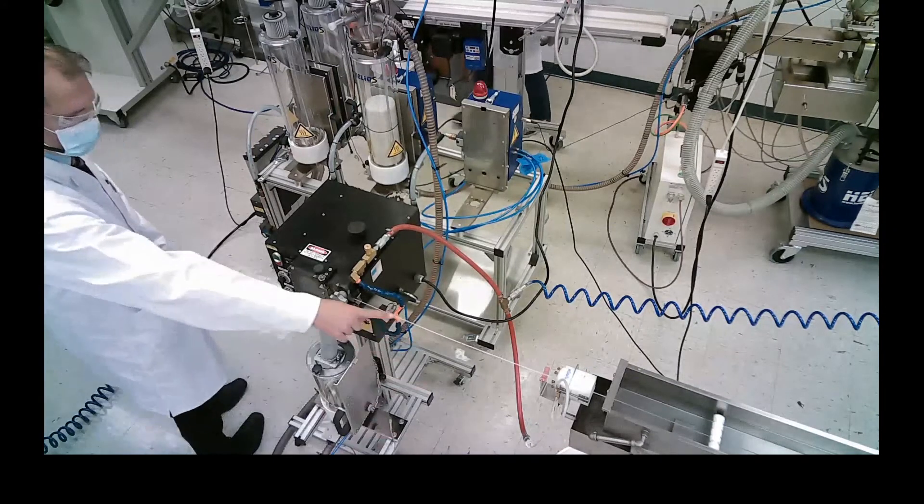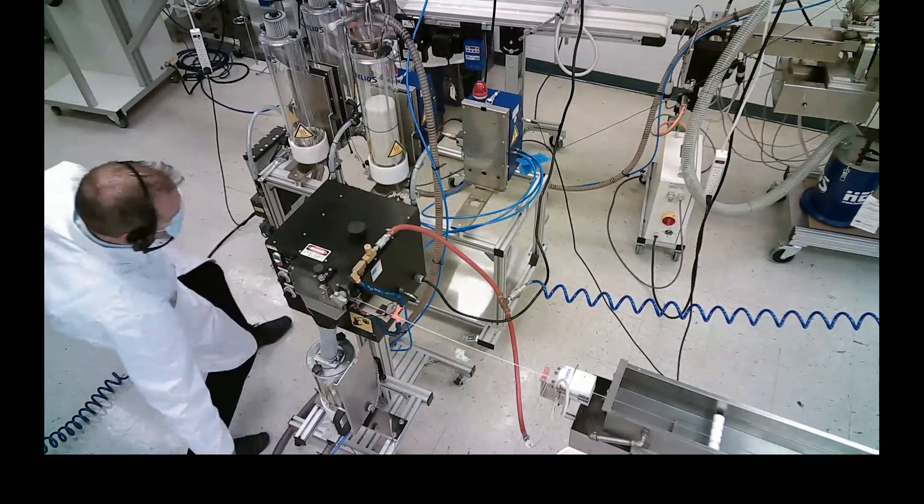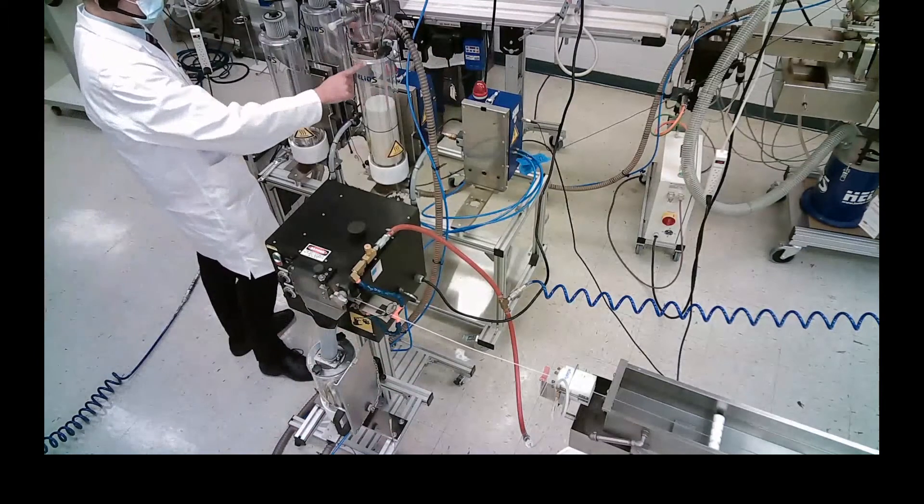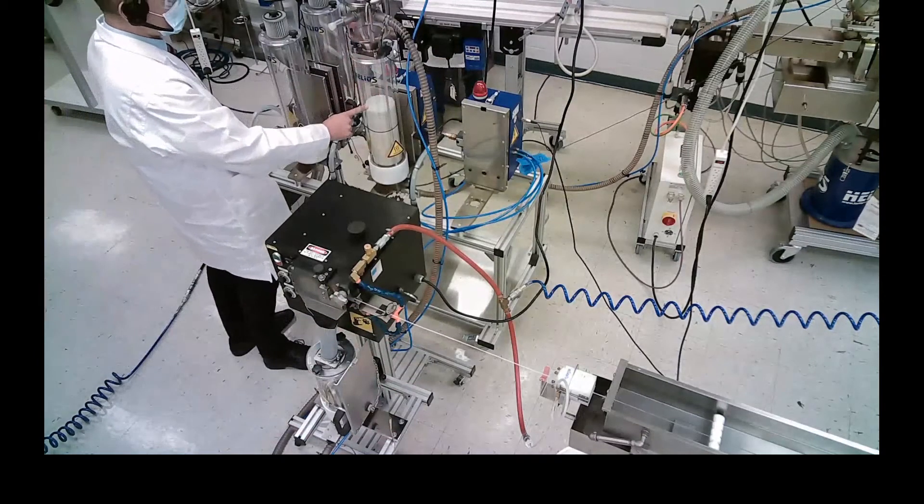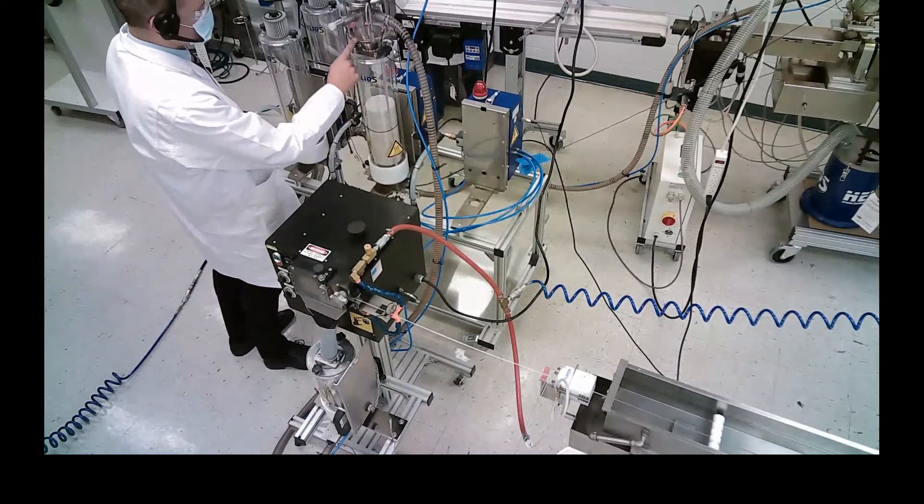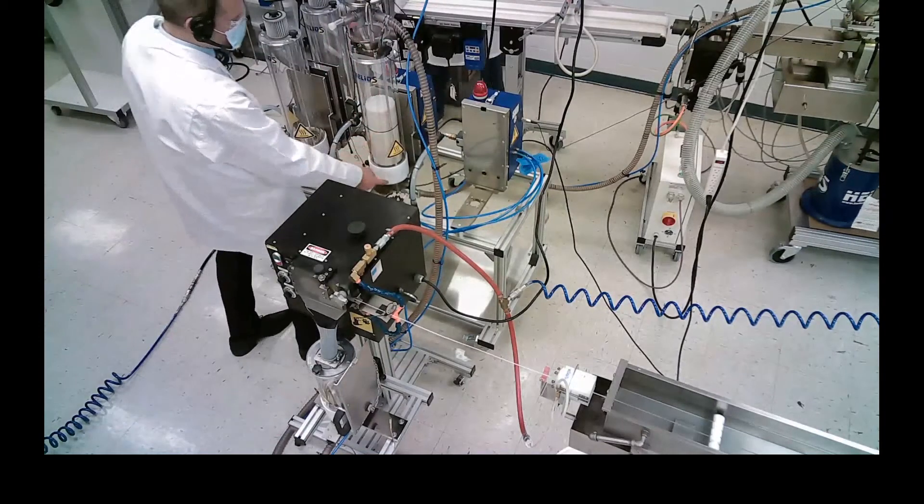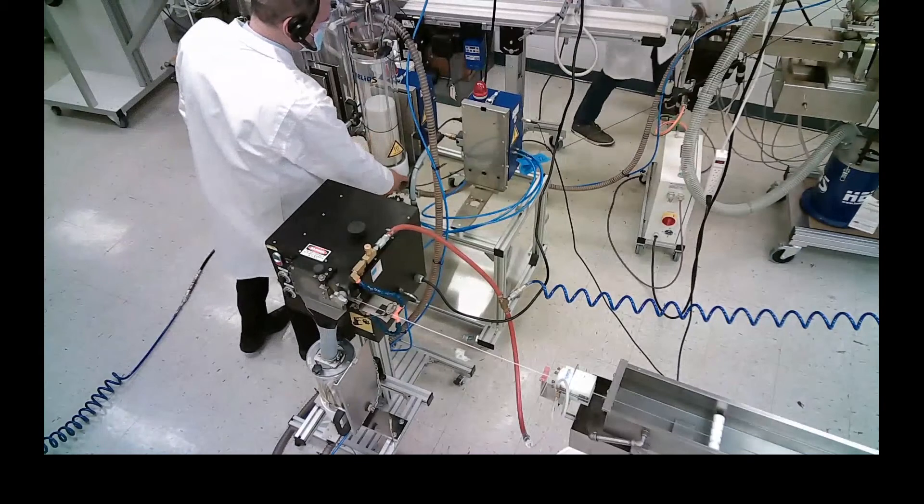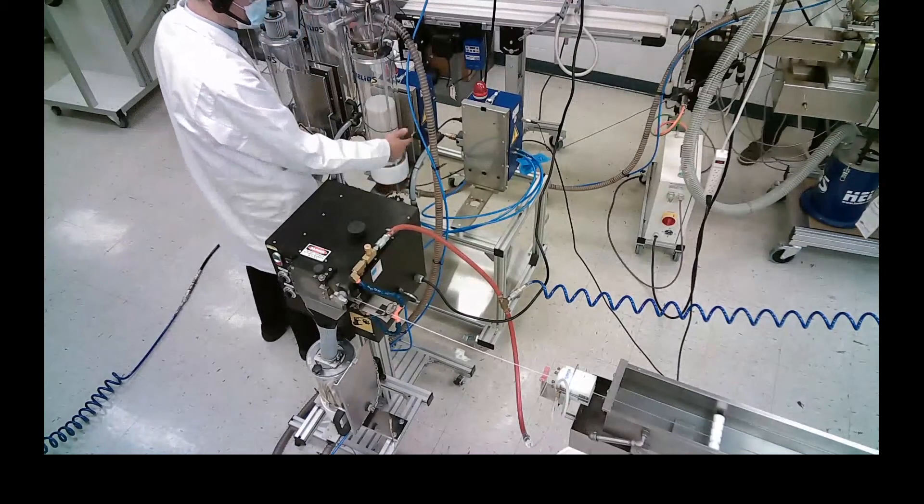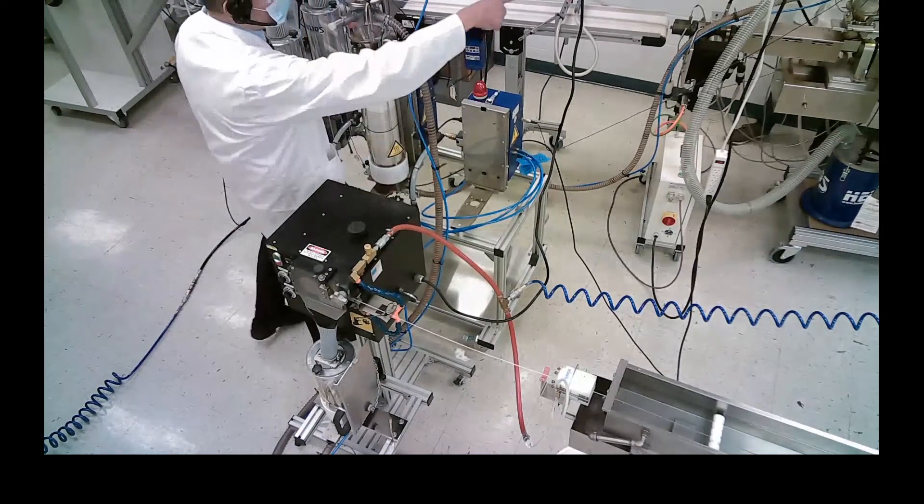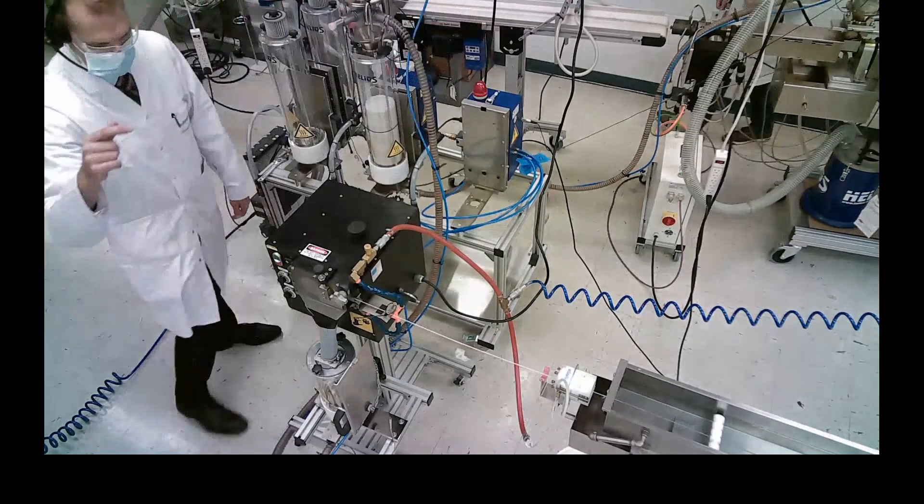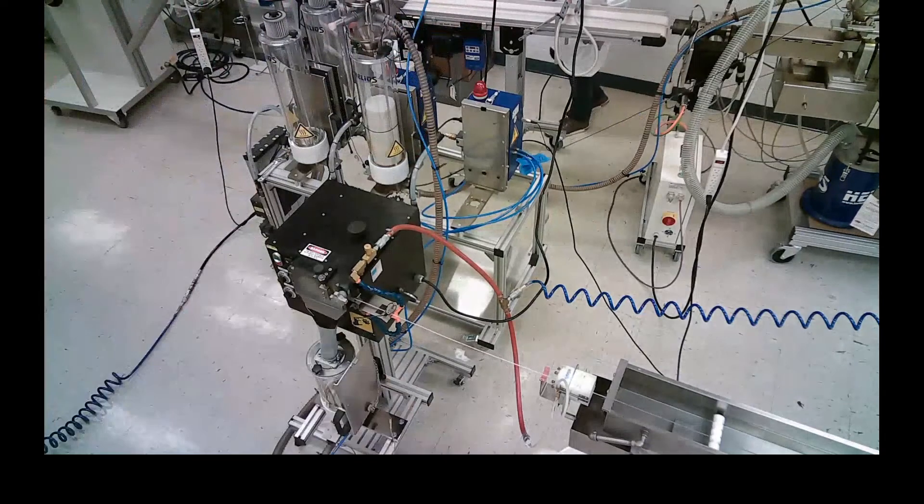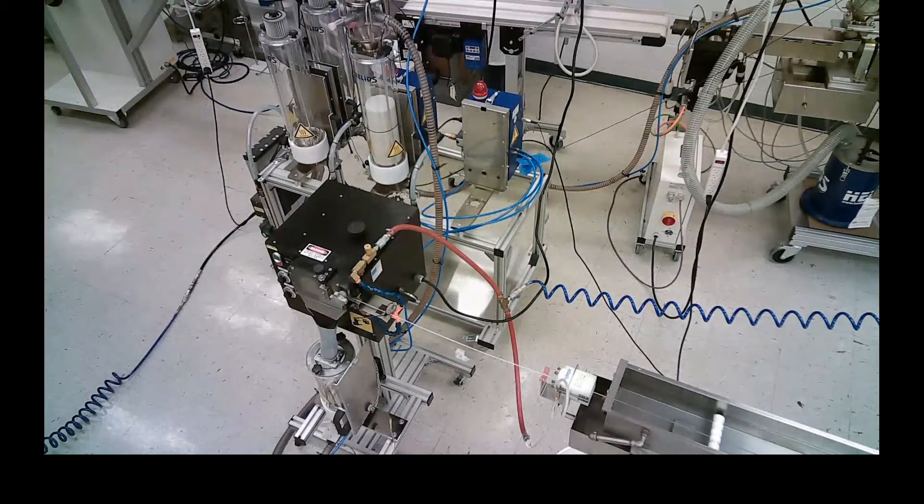It would fall into the now constructed hopper system. This is a unique setup that we picked for very sensitive material to ambient oxygen exposure.